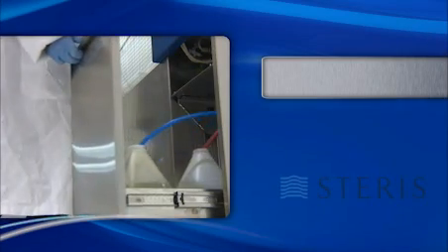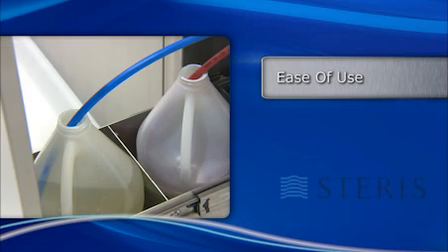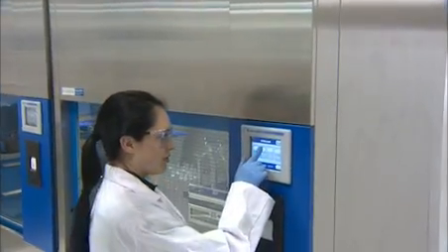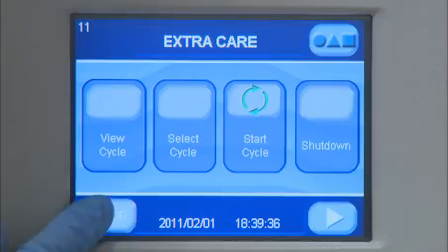With ease of use in mind, the washers can be connected to remotely located large detergent containers, or users can choose to take advantage of the integrated compartment for smaller containers. The washer's advanced PLC control helps you easily operate the system, adjust and monitor critical system parameters.